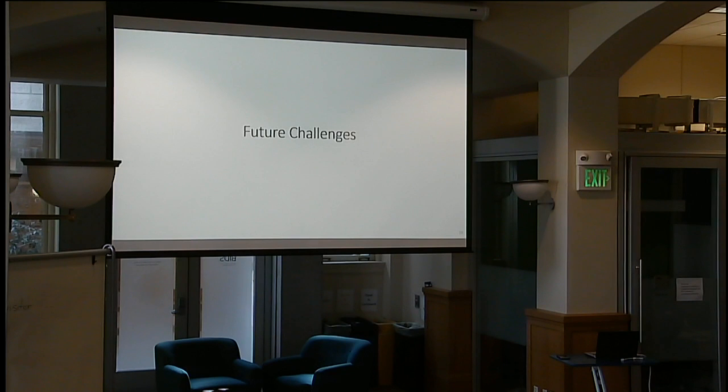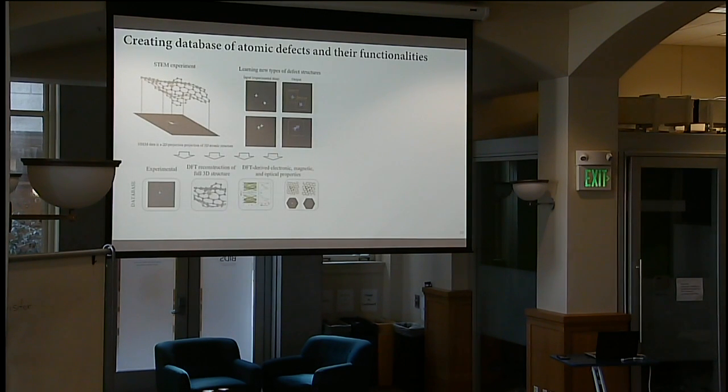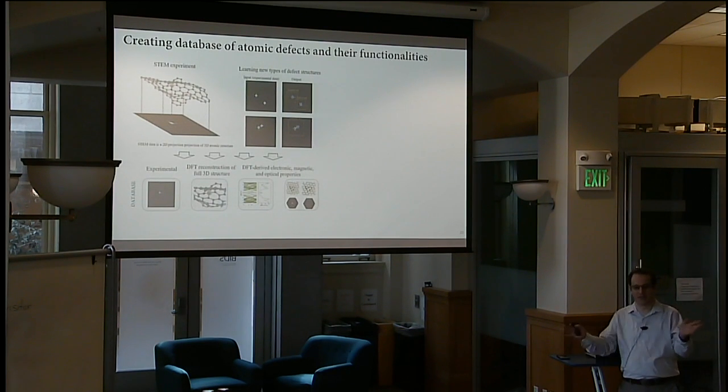Okay, so I wanted to just spend 2 slides to tell you what are future challenges in my opinion. I think that one thing that is kind of troubling right now is that we collect a lot of data, we analyze a lot of data, but how do we actually store it? Well, there is no proper way of doing it in this particular domain.